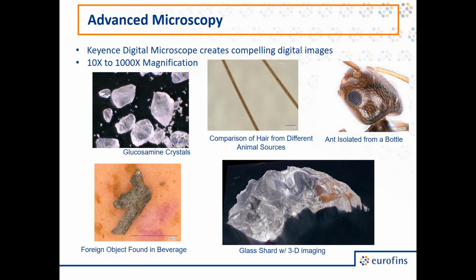For biologicals, the good images are very important and can be as important as chemical data. The little guy in the upper right-hand corner, to the naked eye, just looked like a little black dot. It was only when we put it under high magnification that we found our pet Fred, who got into a product error.